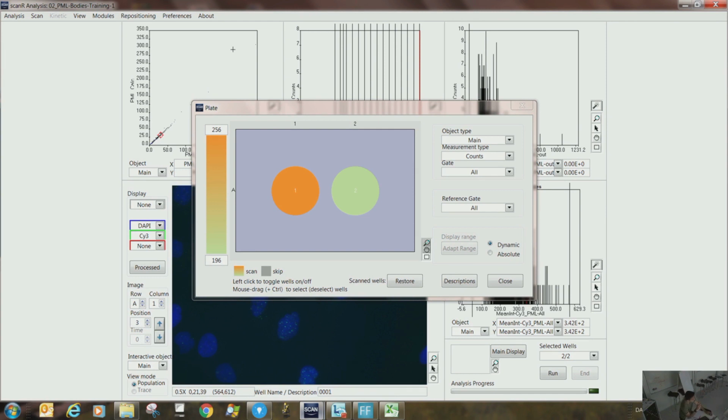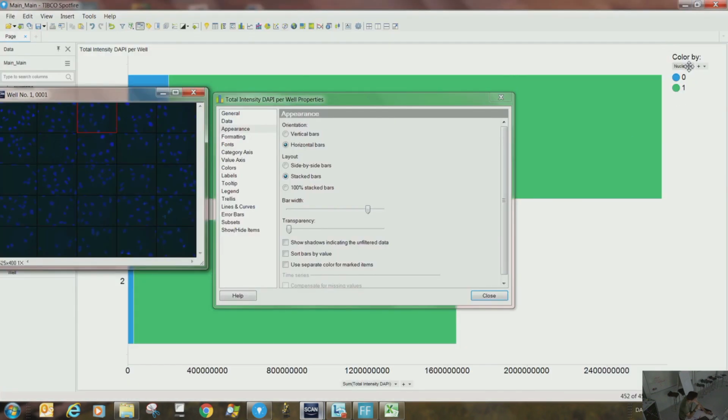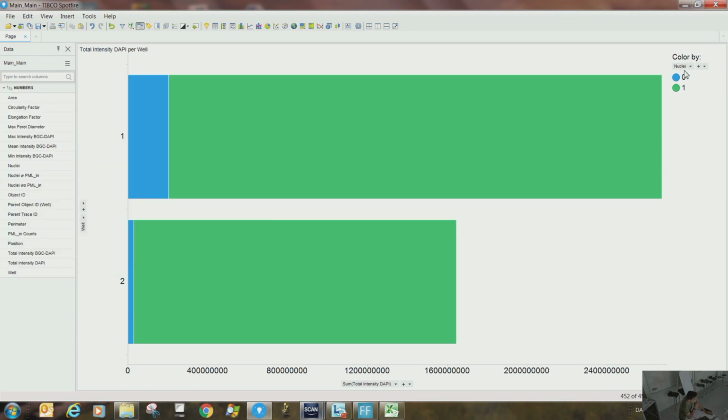So those that have got 1 in front of their rows are healthy nuclei, and zeros are not healthy nuclei, right? So this is what we are exactly doing here. There is one column whose name is nuclei, which is just a binary number, 0 and 1, and we are stratifying this based on this nuclei color.